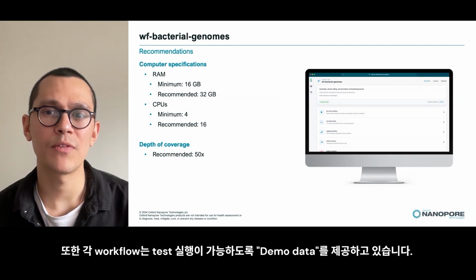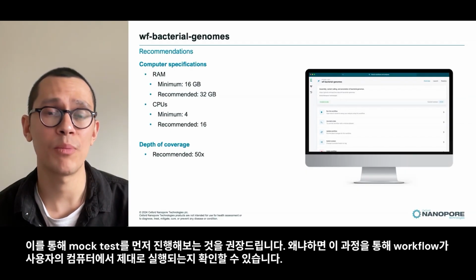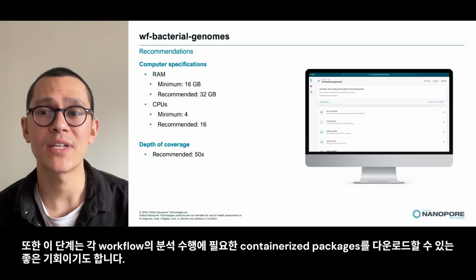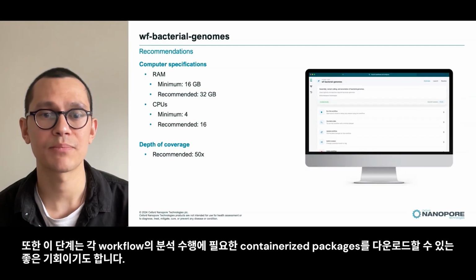Each workflow also provides some demo data to use as a test run. We recommend running this to ensure the workflow will execute properly on your machine. It's also a good opportunity to allow the workflow to download additional containerized packages needed to run the analysis.